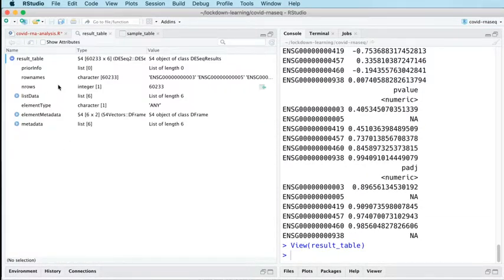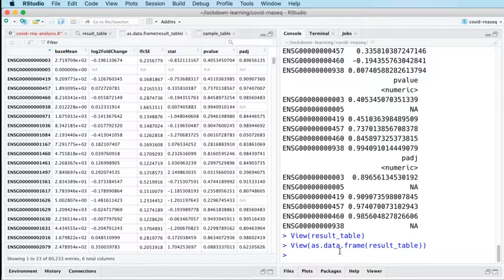It's not a data frame, because everybody likes to do this differently. Sorry, there's been a lot of this today. I'm aware of that. Why is my R session now frozen as well? Let's just do as.data.frame. Let's just do it the quick way. There we go. That's better.